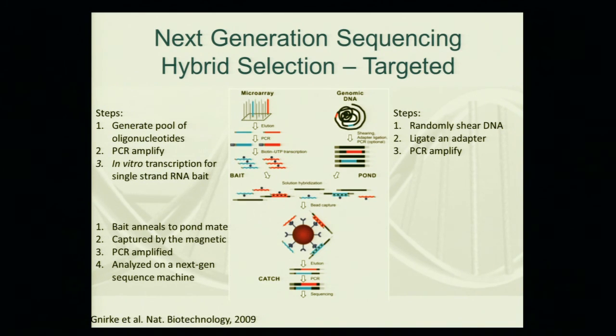At the same time, what we're doing is we're taking our genomic DNA, we're randomly shearing the DNA. What I mean by randomly shearing the DNA is really I'm randomly breaking up the DNA into little bits and pieces. And we can do that by doing something called sonication, which basically makes the DNA vibrate at a certain frequency. Because it's a coil, when it vibrates, resonance kicks in, and then it breaks apart. Really lovely physics if you want to think about the biophysics of the activity.